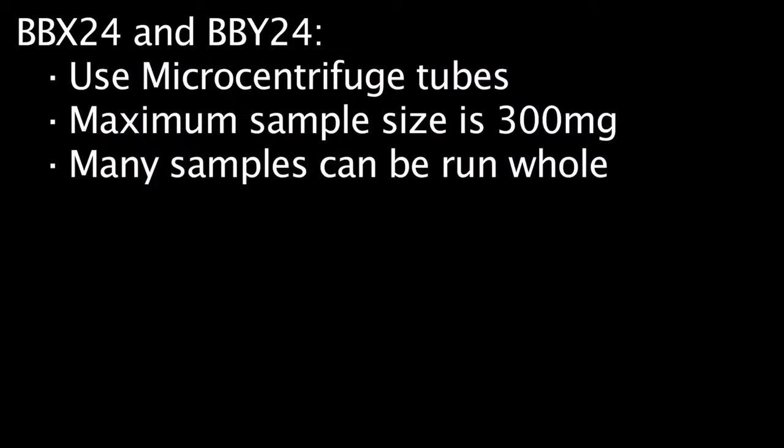The BBX24 and BBY24 model bullet blenders homogenize samples inside of microcentrifuge tubes. The maximum recommended sample size is 300 milligrams.